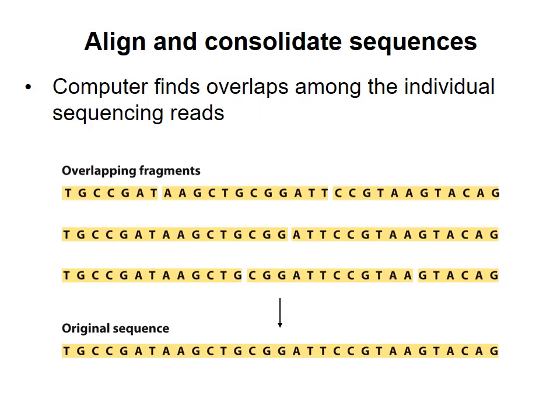The next step is to have the computer look for overlapping sequences among the 24,300 reads obtained from the plasmids. That's illustrated in this diagram, where each yellow rectangle represents a different sequencing read. These reads will end in random places, because random fragments were obtained by sonication when making the genomic DNA library. Some reads will span or go across the gap or break between other reads. The goal is to put the different fragments in order and reconstruct the original genome sequence.